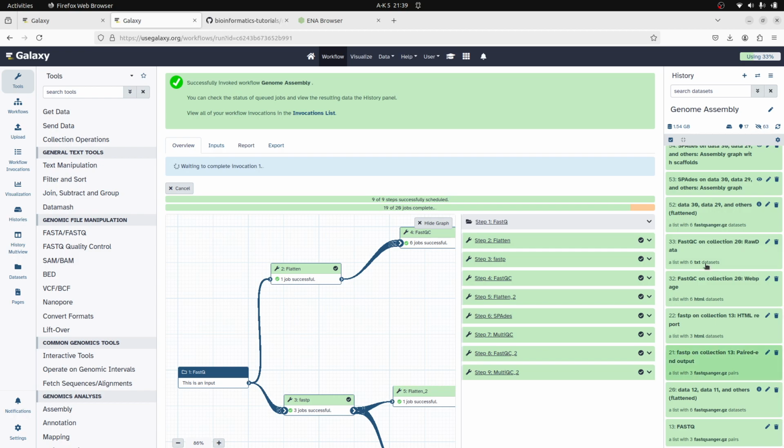So what we did was a simple workflow for genome assembly. If you are doing genome assembly, let's say for bacterial genomes, then one of the things you can do is to evaluate the genome assemblies using tools like QUAST, and then you can also check for genome completeness using tools like BUSCO. You can also proceed further to do your genome annotation and then count the features, pangenome analysis, etc. So basically, depending on your objectives, you proceed with the downstream analysis.